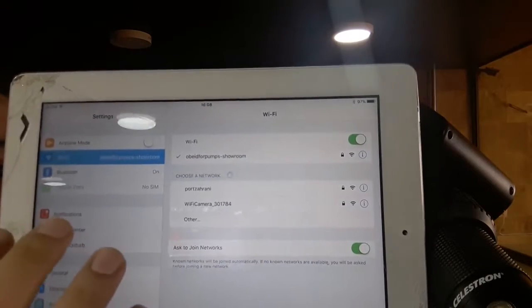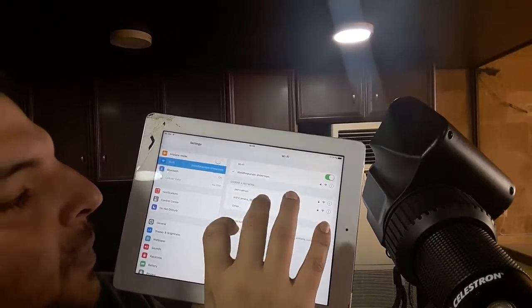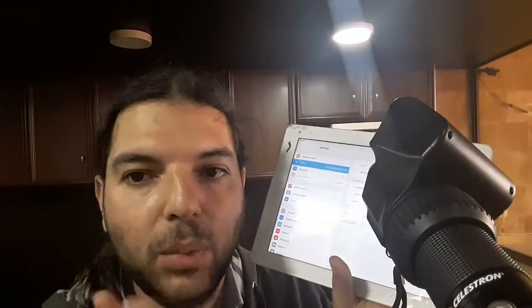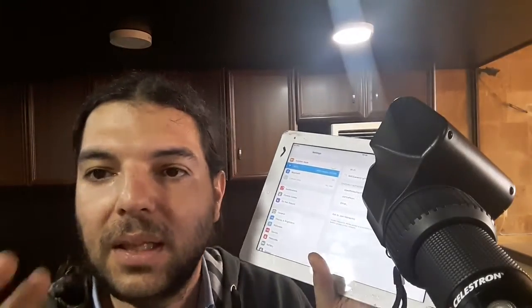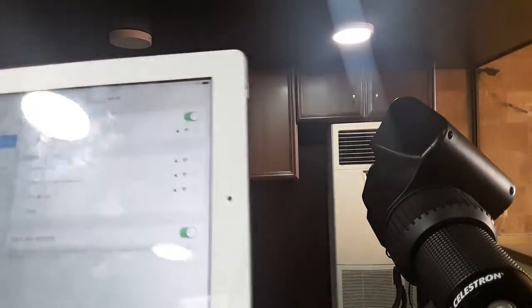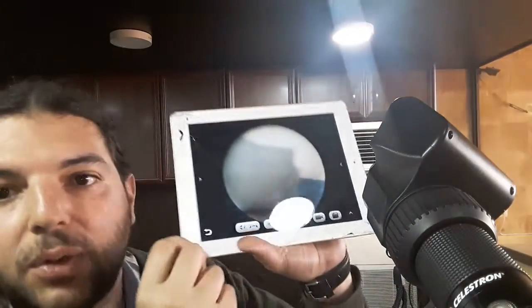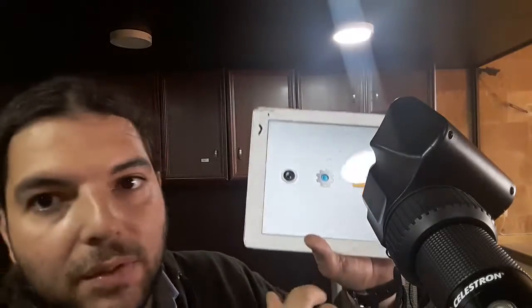You will see the Wi-Fi camera listed — the camera is acting as an access point. Note that your iPad won't be connected to the internet in this mode, because the camera is not a gateway to the internet. The Wi-Fi password is 12345678 — just type the numbers 1 to 8. Then go to uCam Plus.